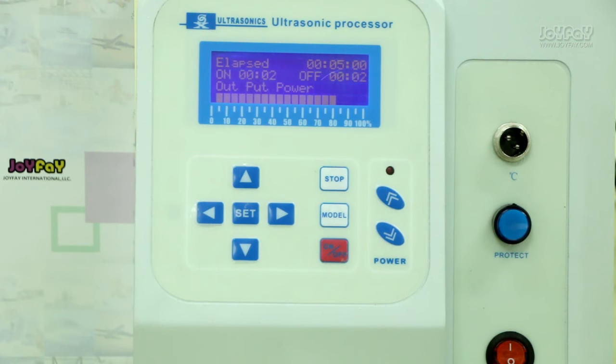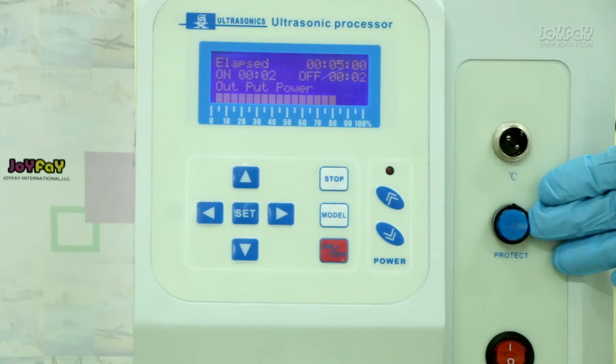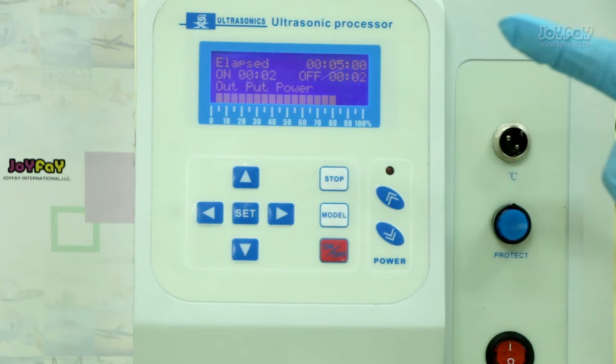We can start our experiment after this process. Our machine has an amazing self-protection design. When the blue button lights up, it means there is something wrong with the machine, and you should check what happened. The blue light typically turns on in three situations: 1. Idling — the probe does not dip into the liquid. 2. Overvoltage. 3. The machine is broken.